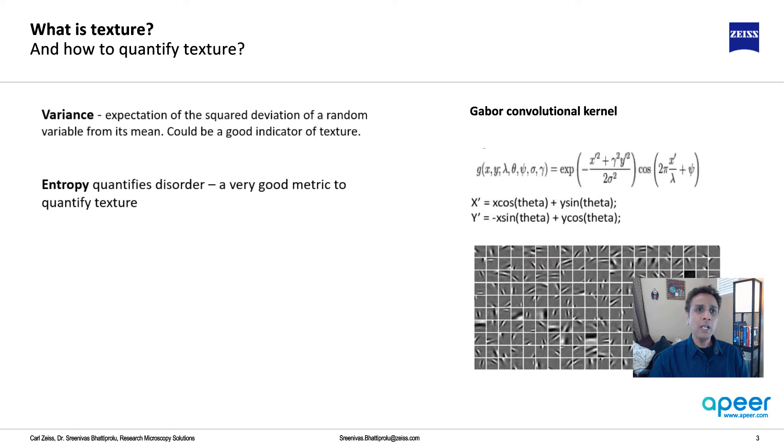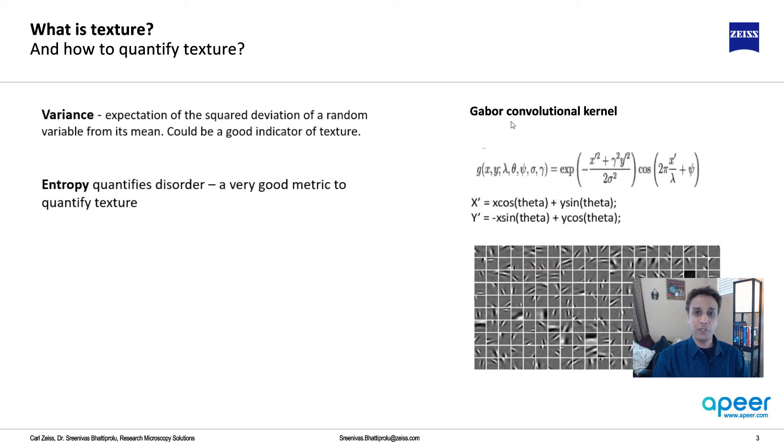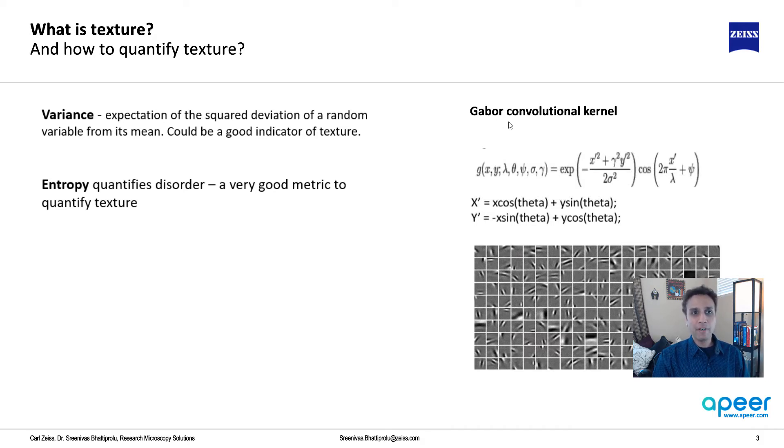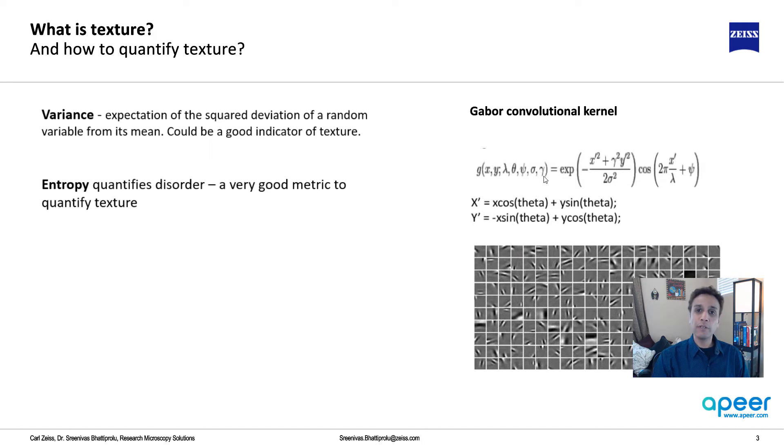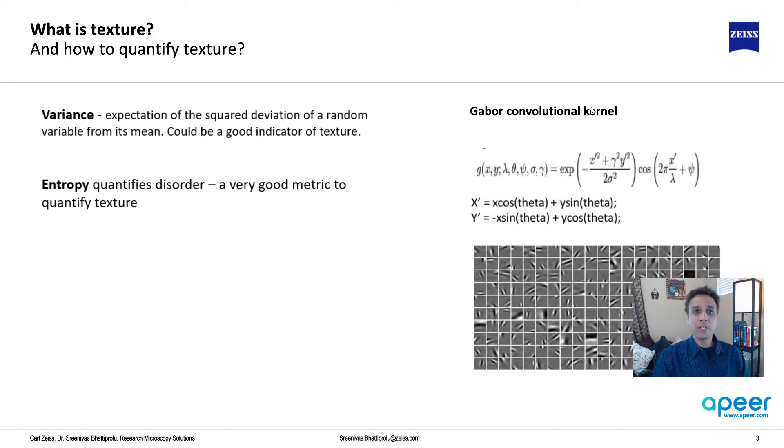Gabor is a great way of extracting features and a very good texture detector. But the problem with one single image is you don't know what combination of lambda, theta, psi, sigma, and gamma will give you the best image. That's why it's great for machine learning, but may not be good for single filter applications.